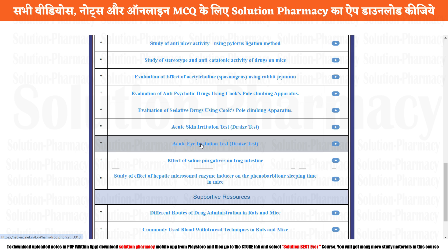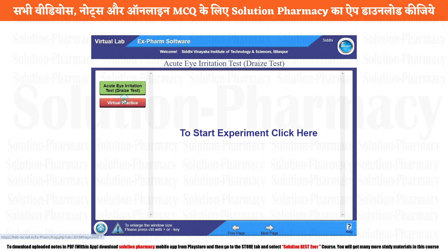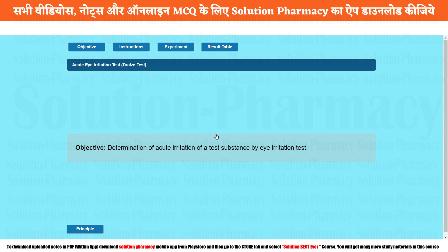To perform that experiment, click on the objective. Once you click the object, there is a basic interface of Xform software. Now click on the Virtual Practice tab, and again to start the experiment, click here. Once you click the objective, you will find the basic headline on the top of the application — objective, instruction, experiment, and result tabs.